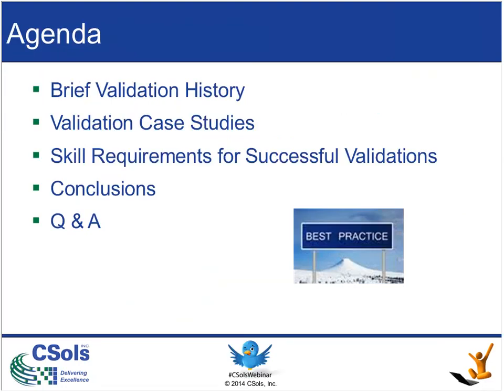So today we're going to talk about a number of items in terms of the special requirements for laboratory validation. I'll go over a brief history of validation, how it started, and how we got to the point we're at today. I have a number of case studies of real companies we've been exposed to and some of the situations that we've seen in various laboratory environments.